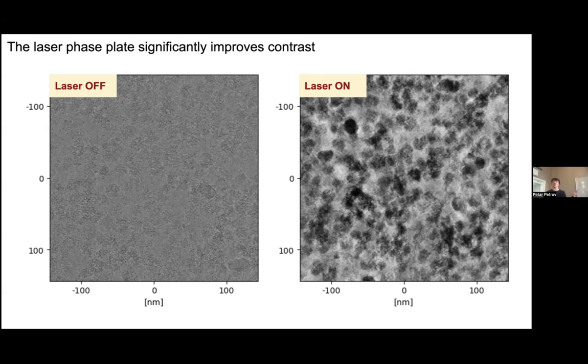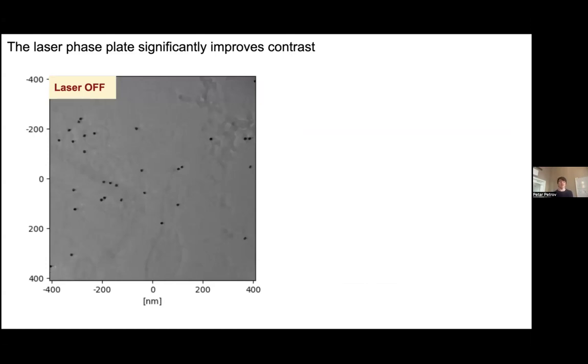But this is a huge protein. The ribosome is quite a bit larger than most proteins, which are not able to be imaged by cryo-EM at all by this technique, because they're too small. So as you reduce the size of the protein, this thing is just going to fade into the noise. And if you look at a really small protein, you'll just see noise, and it won't mean anything to anybody. So one of the goals of this project is to look at smaller proteins than we have been able to see before, and also to look at more complicated fields of view.